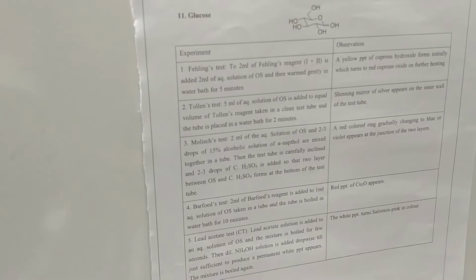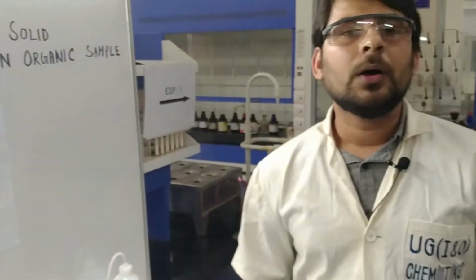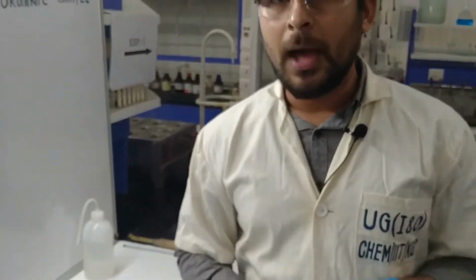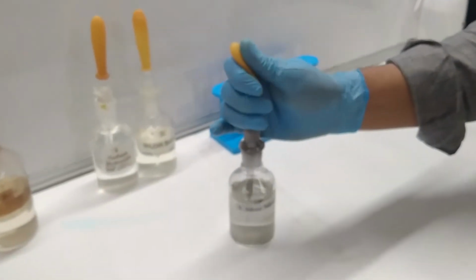Then the next test is what? The second one is the Tollens test. Okay, so for the Tollens test, what do we have to do? First of all, we have to prepare a Tollens reagent. For that we have to take a test tube. First of all, we have to take 1 ml of silver nitrate solution. Okay, so this is the silver nitrate solution. I just take approximately 1 ml.